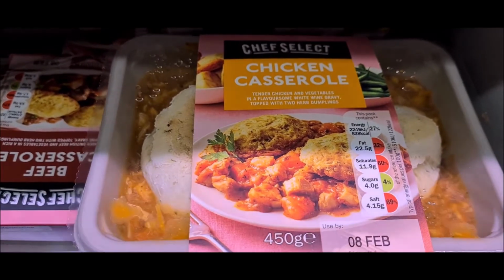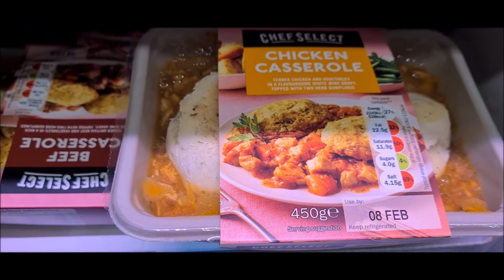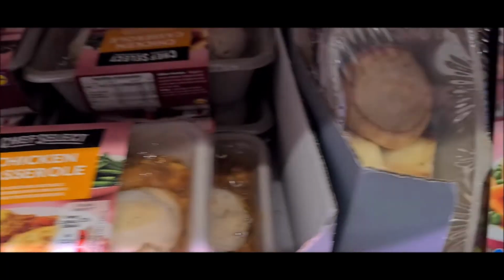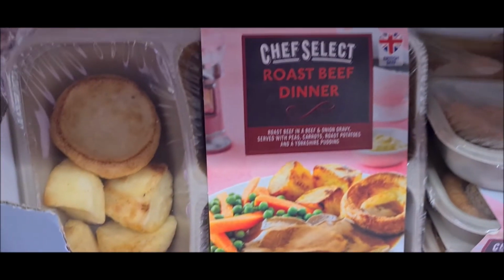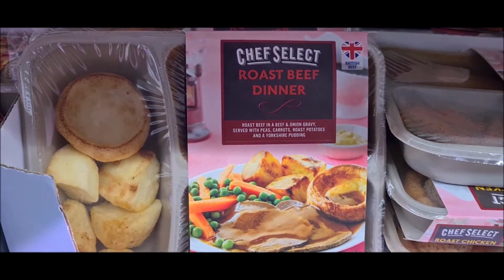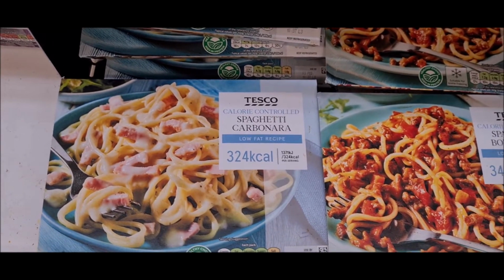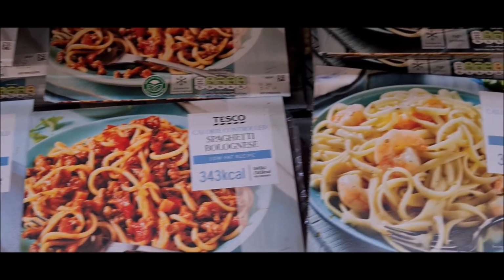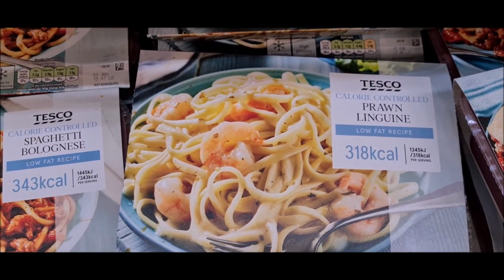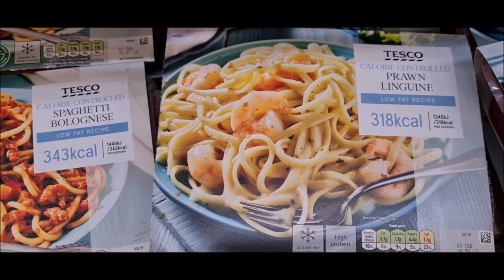To ensure consumer safety and prevent foodborne illness, such food products must meet set minimum microbiological criteria before they are sold on the market for human consumption. Such microbiological criteria are set by national regulations as a legal requirement, and compliance is mandatory. Guidelines are, however, developed by food safety regulatory agencies, including public health authorities in respective countries, in support of the regulations on microbiological criteria. Ready-to-eat foods must therefore be tested and must meet these set criteria.